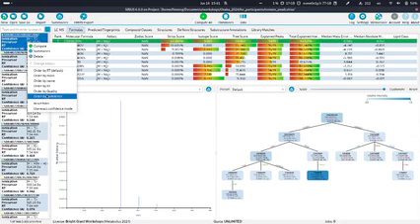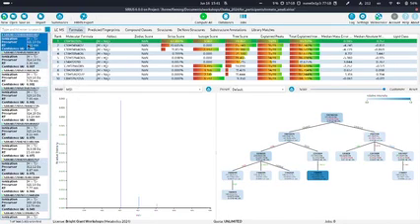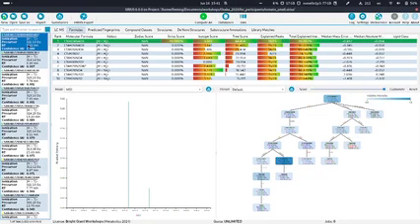Just right-click anywhere and click on Order by Confidence. Then you will see that at the very top, you will get the feature with the structure hit that has the best, the highest confidence score, in this case 1. Okay, let's use this feature as an example.